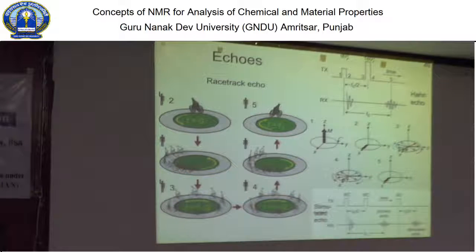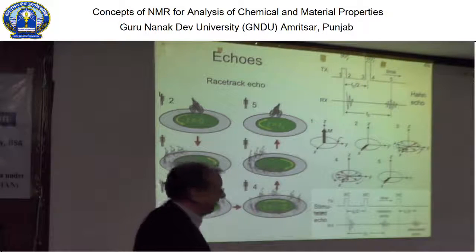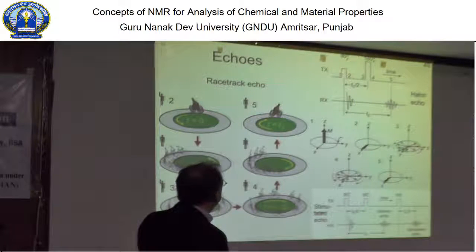And that gives the echo. So normally, after the 90 degrees, we put the pulse in the y direction. Is there any particular reason? Yes, there is a particular reason, because it's better in terms of the phase and pulse errors that you get. So the better explanation is, actually, I've done that too.